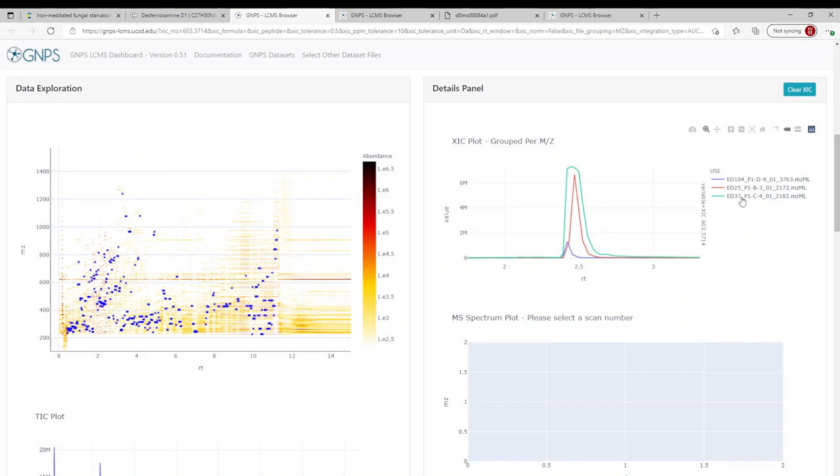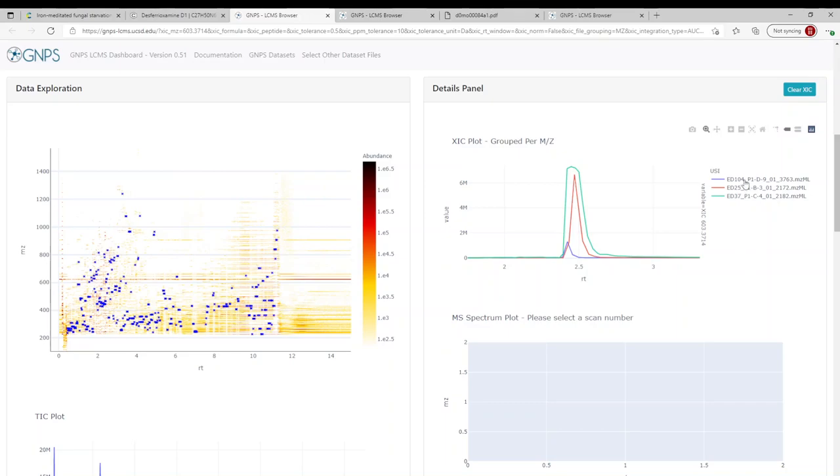And so desferoxamine D1 is kind of your standard, basic streptomyces siderophore. Siderophores are a class of compounds that chelate iron, and so they're important for the organism to gain ecological niche. And so in all three conditions, we see production of the compound. Now qualitatively, we can see that potentially we have more desferoxamine D1 in the co-culture samples. But of course, this just being mass spectral data, we have to be careful with this assumption, because we're actually looking at ion counts, not concentration in any possible way.